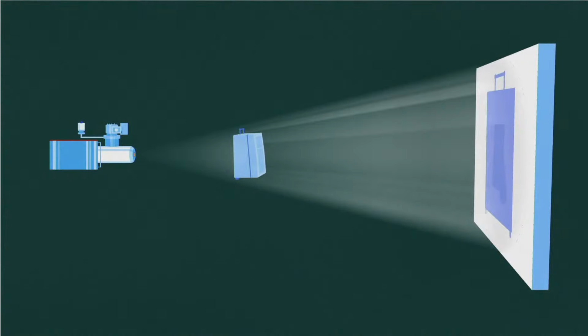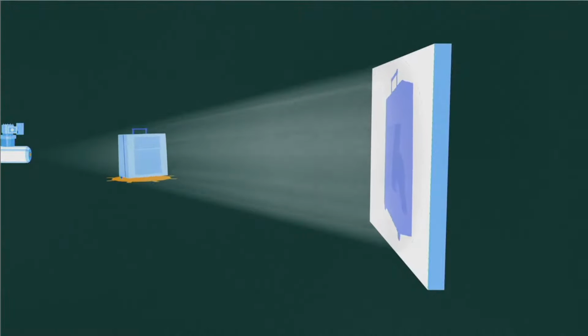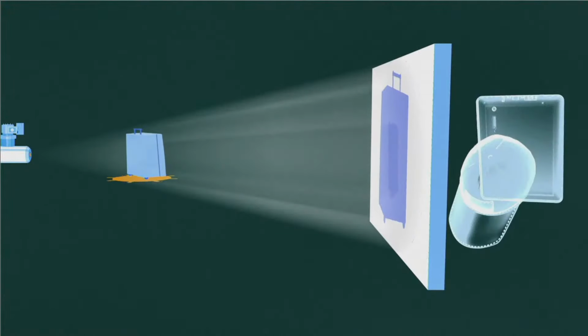Unfortunately, if multiple features are present inside the object, the image is hard to decipher. This is overcome with a technique known as computed tomography. Several projection images are collected as the object is rotated. The object is digitally reconstructed, revealing the position of features in the object.